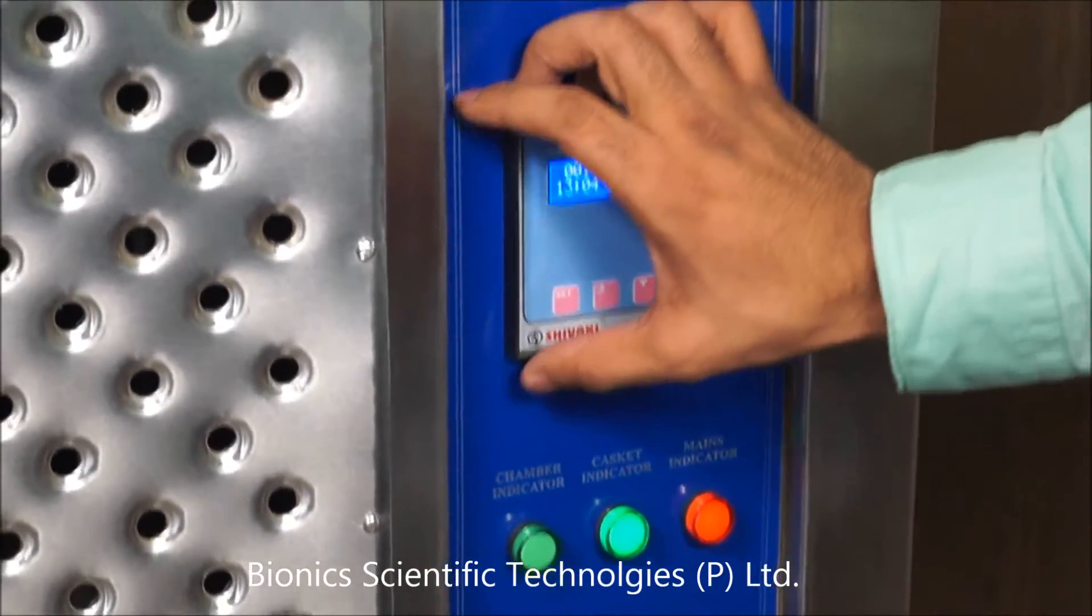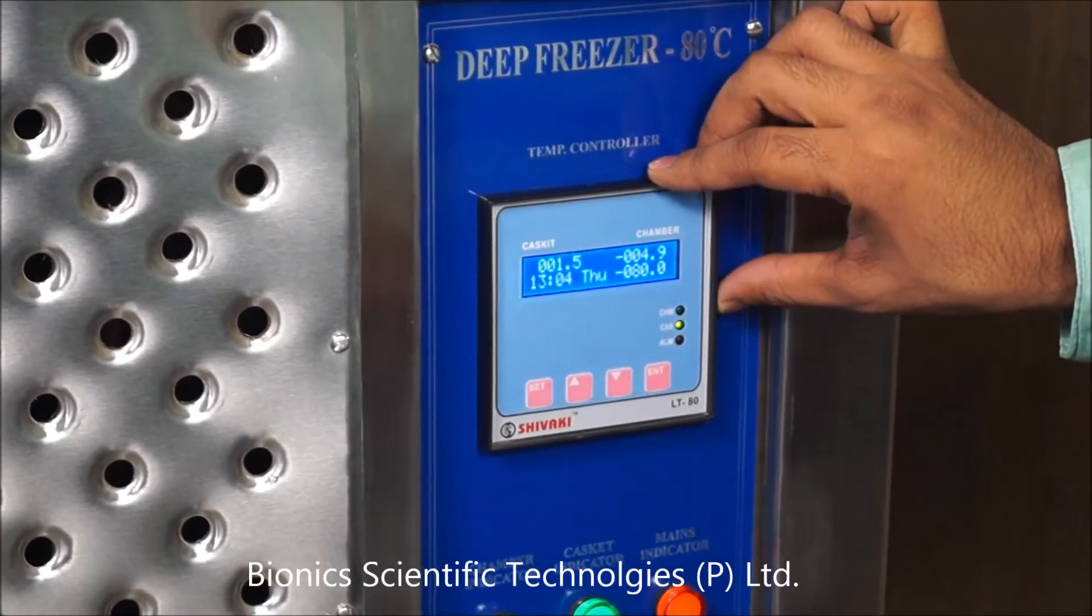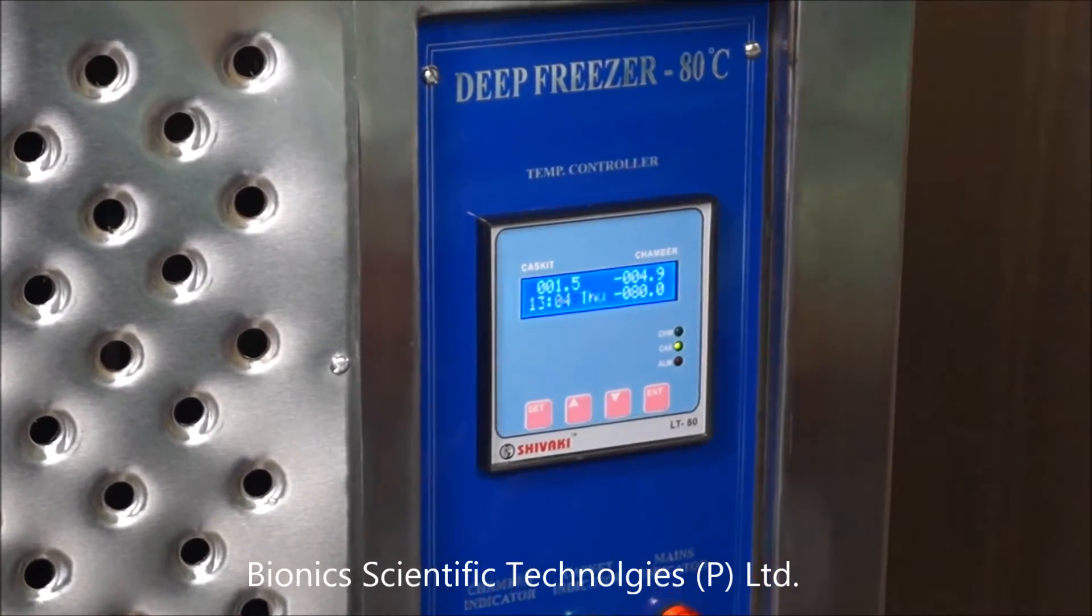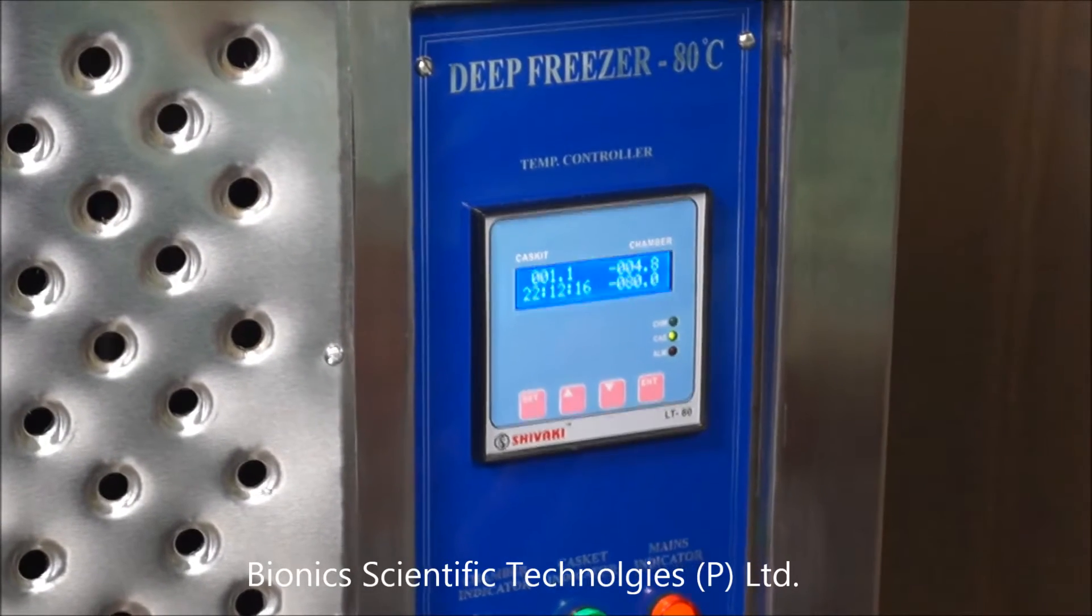And this is the microprocessor-based PID controller, from which you can set the temperature according to your requirement.